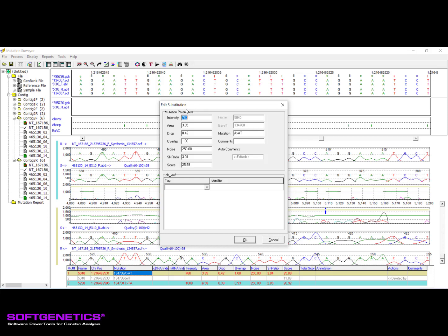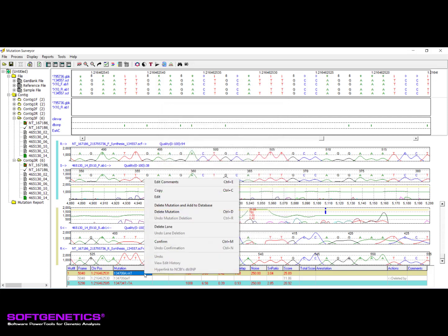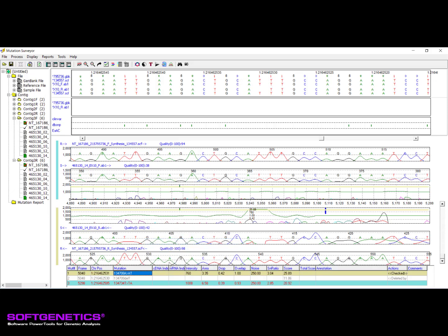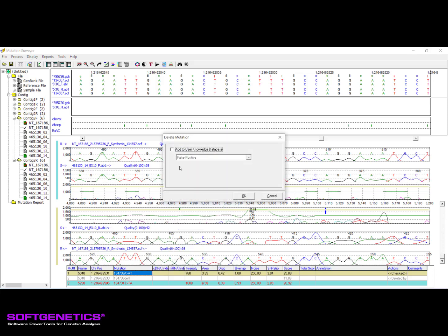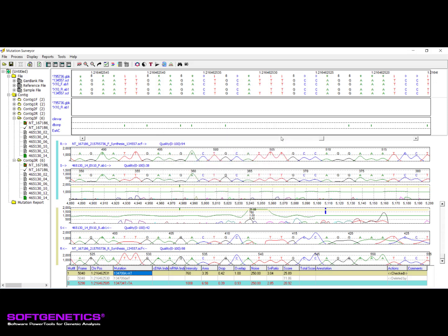To change the type of variant called, such as from a substitution to an indel, the original call should first be deleted and then the preferred variant type added. Mutation calls can also be confirmed or deleted. Confirming the call results in the text color of the call turning black. Deleting a call will result in a gray text color in the mutation table. If all requirements have been met when attempting to delete a call, the option to delete and add to database will appear in the context menu. This option can be selected to add this deletion to your user knowledge database as either a false positive or artifact for future tracking. Please view the user knowledge database webinar for additional information on this step.